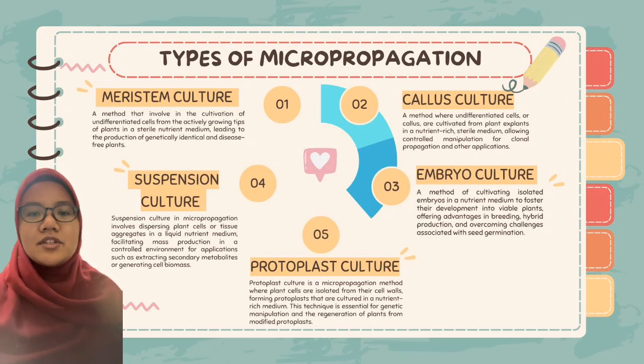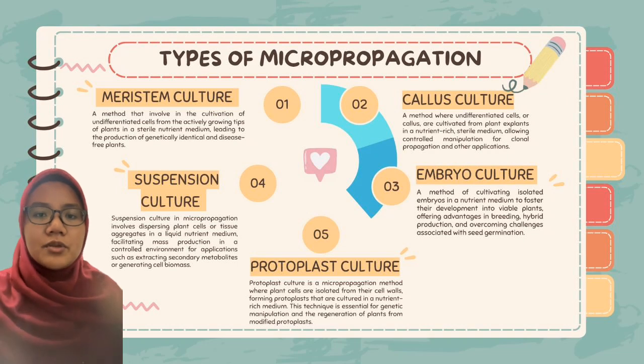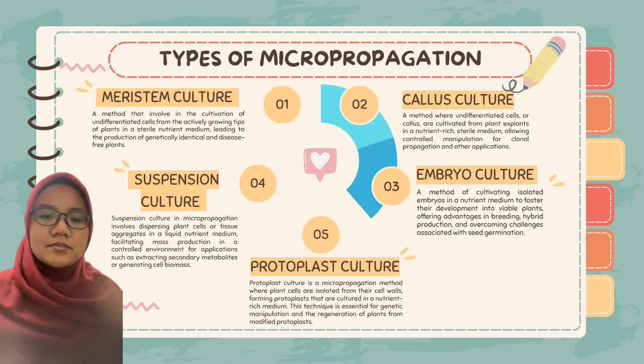And the last one is protoplast culture. Protoplast culture is a micropropagation method where plant cells are isolated from their cell walls, forming protoplasts that are cultured in a nutrient-rich medium. This technique is essential for genetic manipulation and the regeneration of plants from modified protoplasts.